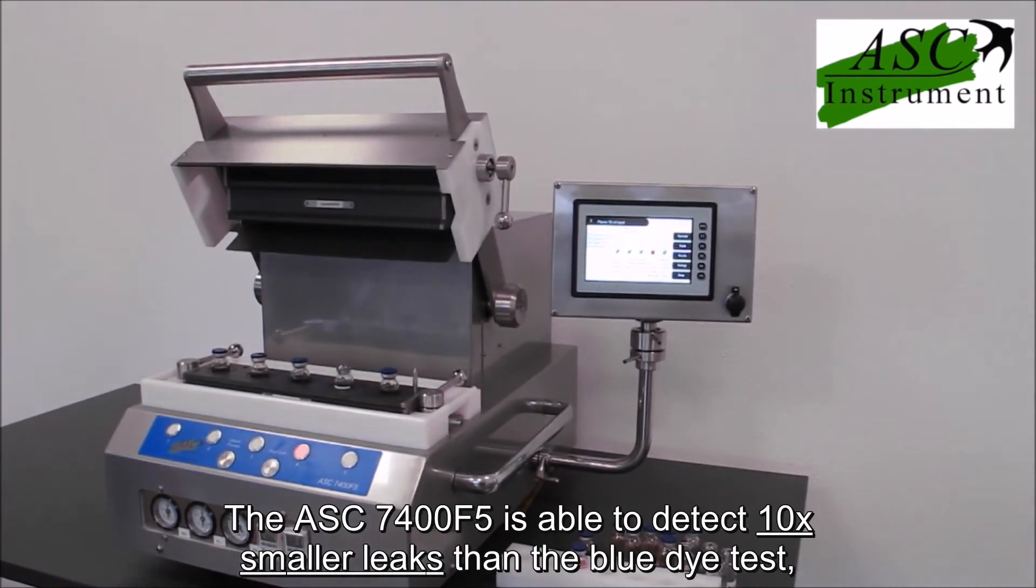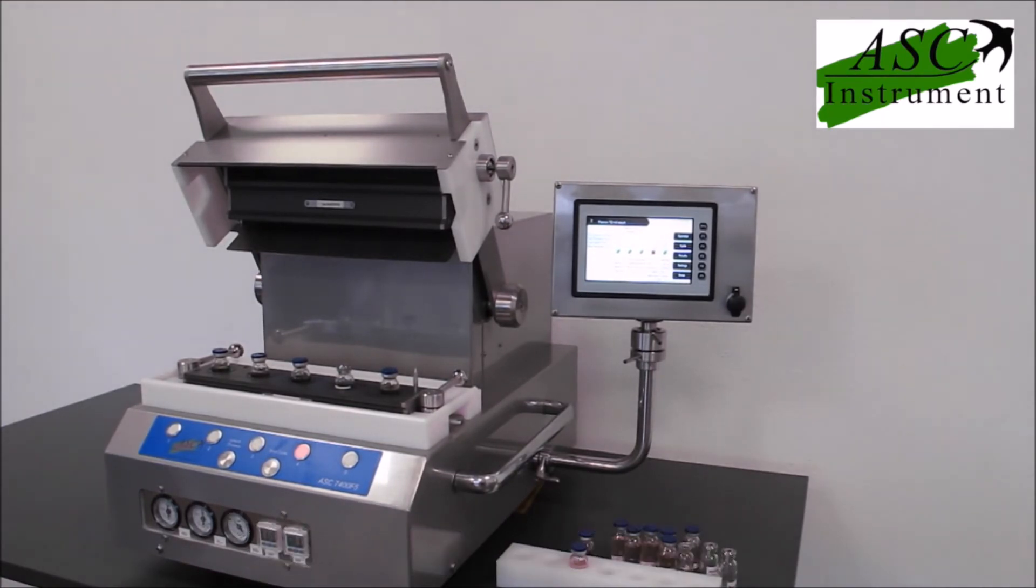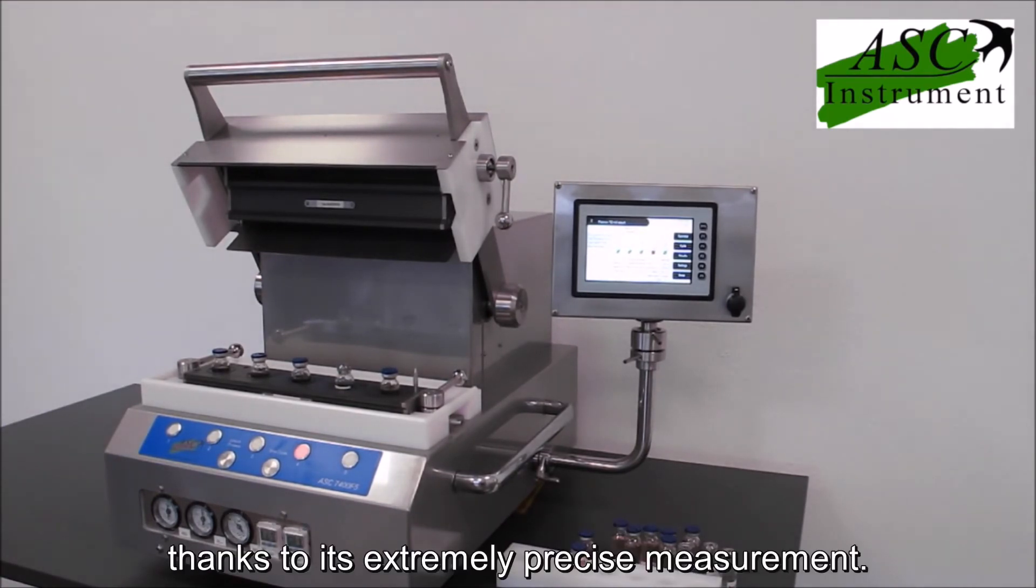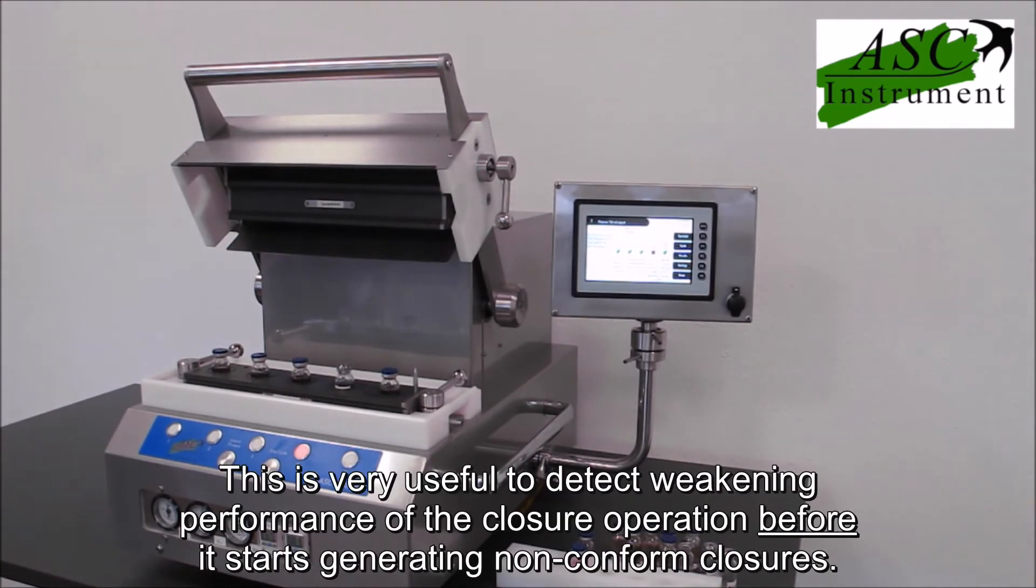The ASC7400F5 is able to detect 10 times smaller leaks than the blue dye test, thanks to its extremely precise measurement. This is very useful to detect weakening performance of the closure operation before it starts generating non-conform closures.